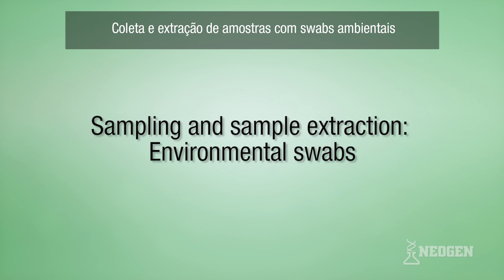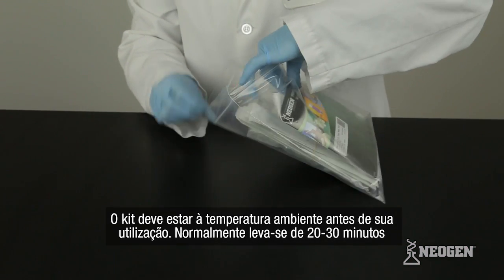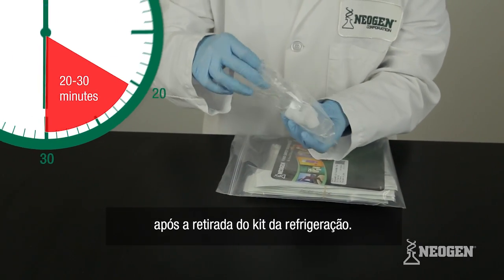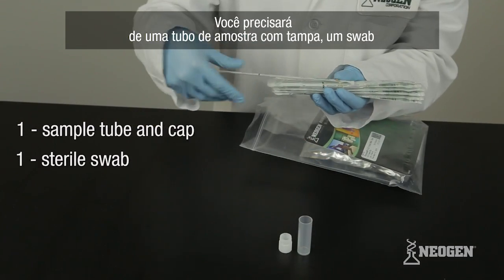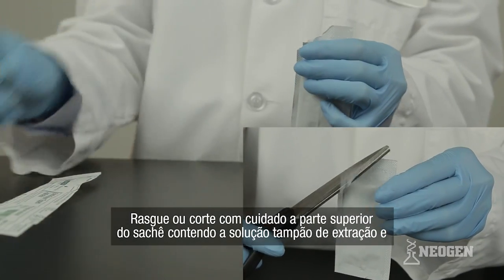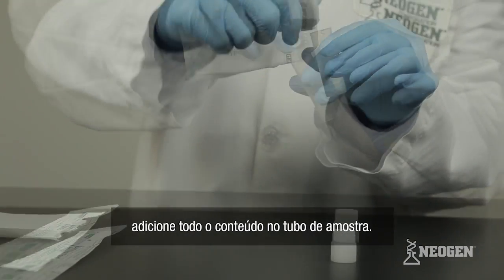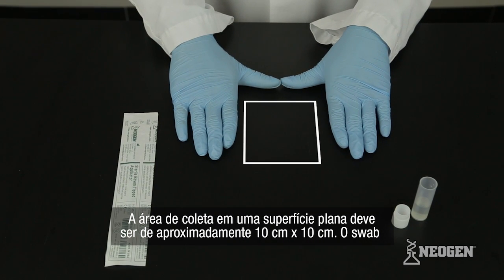For sampling and extraction of environmental swabs, remove the test kit from refrigeration and allow it to reach room temperature — this generally takes 20 to 30 minutes. You'll need one sample tube and cap, one sterile swab, and one extraction buffer for each environmental surface you want to sample. Carefully tear or cut off the top of the extraction buffer sachet and add the entire contents to the sample tube. If testing a flat surface, estimate a swabbing area of approximately 10 by 10 centimeters.